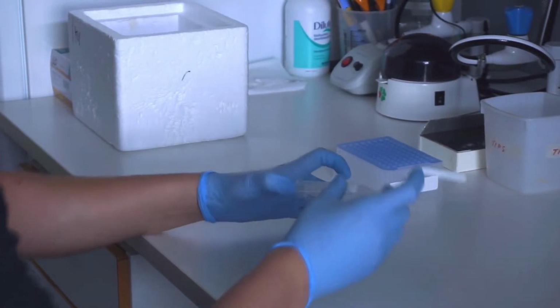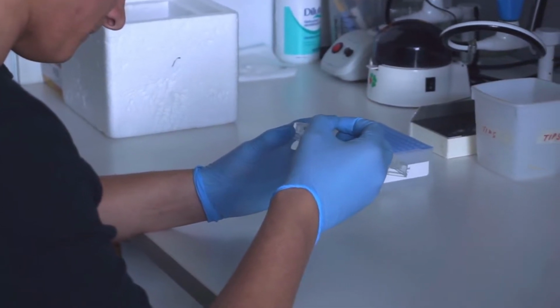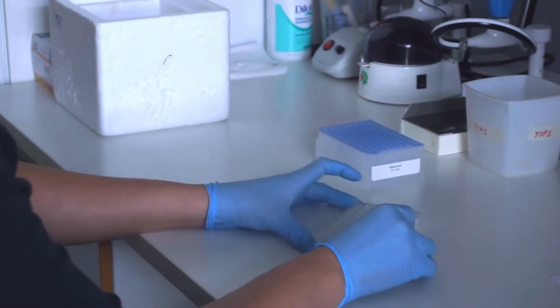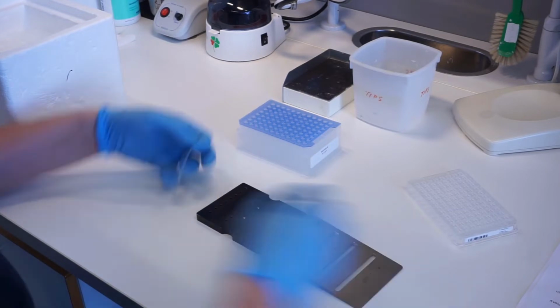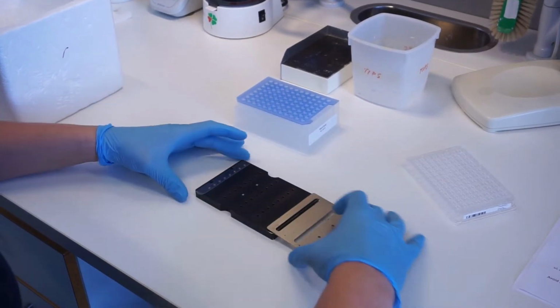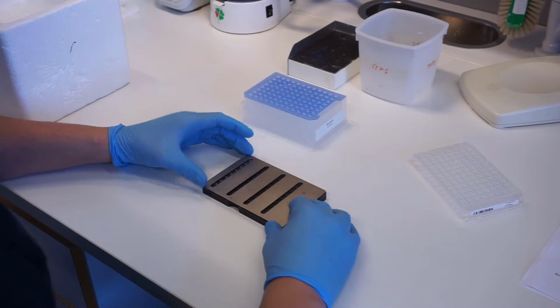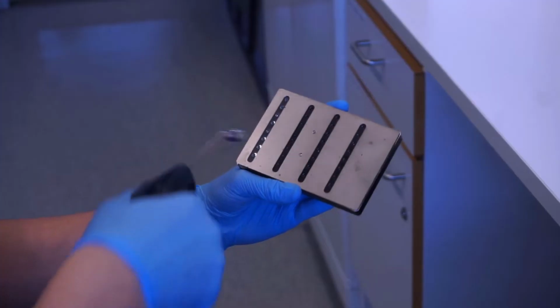On the bench, take the MRC plate and glue the barcode in the middle of the ABC side. Put the protein cup strips onto the strips holder and cover with the magnetic cover. Take dust away from the plate and the strips with a compressed air pistol.